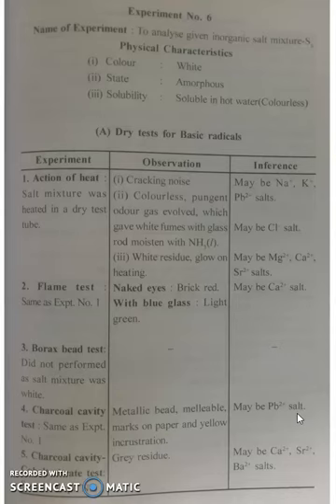Then again you have to perform another experiment. Salt mixture was heated with concentrated sulfuric acid. A colorless pungent gas evolved, which gave white fumes with glass rod moistened in ammonia, maybe chloride salt. Again you have to perform another experiment. Salt mixture was heated with manganese dioxide and concentrated sulfuric acid.